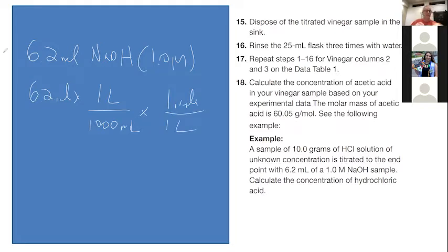So that gives me 0.0062 moles sodium hydroxide.